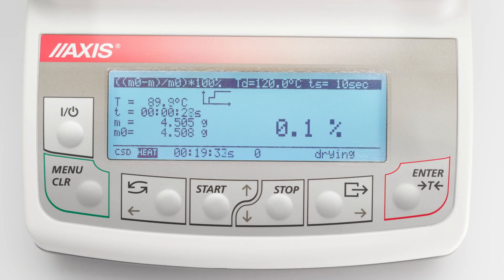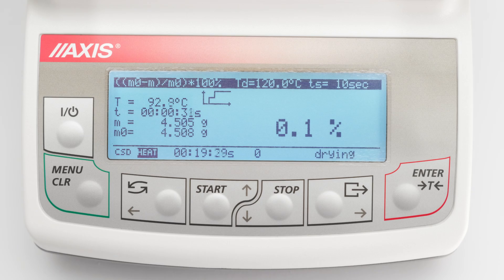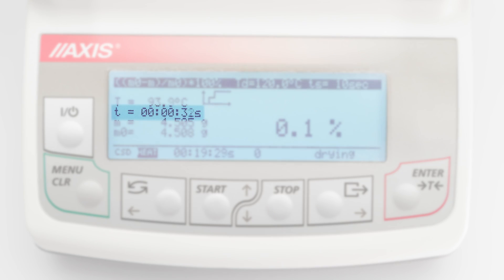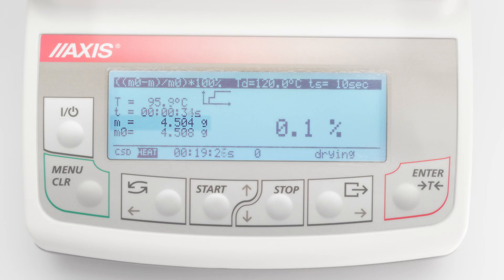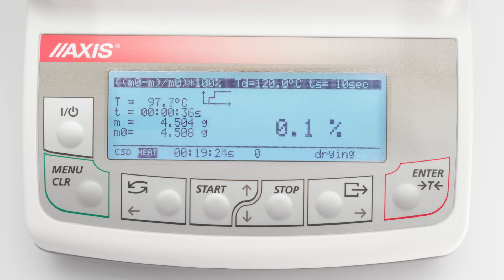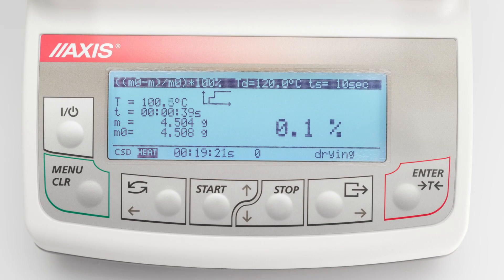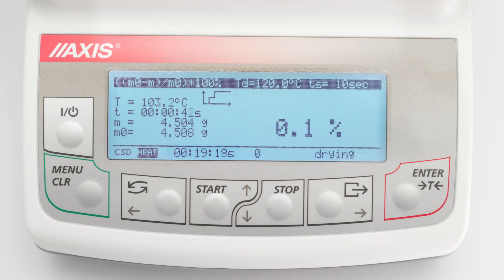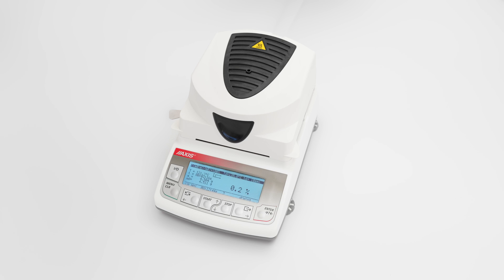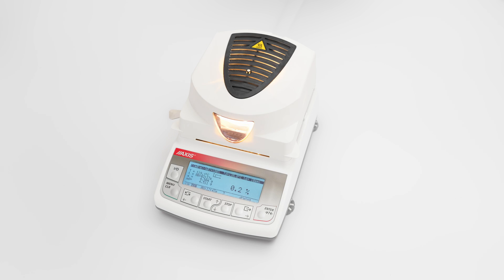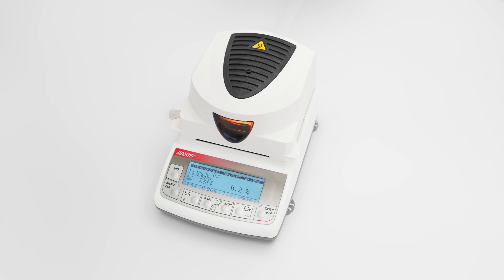The display also shows the current temperature in the chamber, current drying time, current weight on the pan, initial mass, and time to complete the measurement. The end of drying is signaled by an acoustic signal.